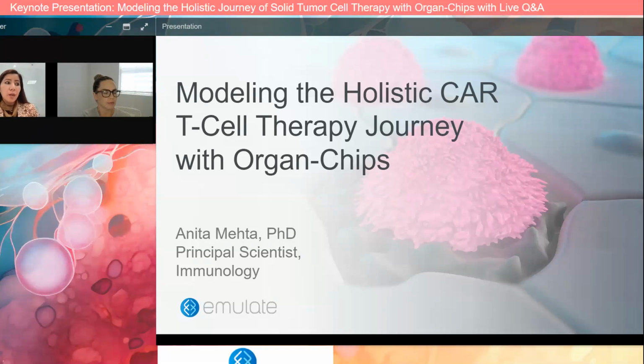Then we also walk you through the plate studies and what is needed in terms of priming stimulus, doing a literature search for chemokines and cytokines, and the chip studies as well. We would be happy to guide the users through if someone is interested in adapting this workflow.